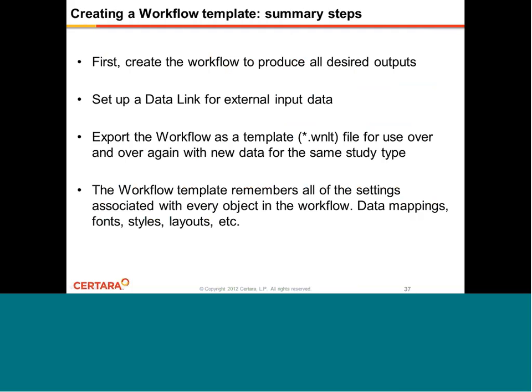So, summary steps to create a workflow template. First, create the workflow of interest to produce all desired outputs. Next, set up a data link for external input data. And then export the workflow as a template file.